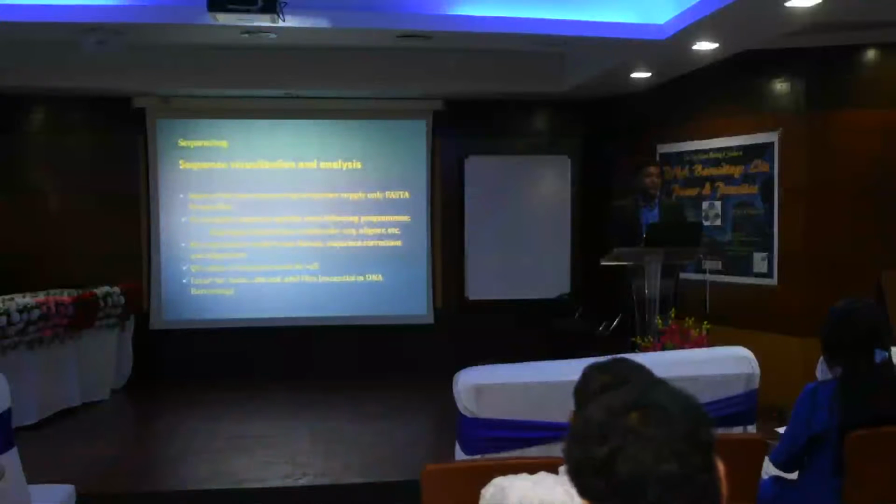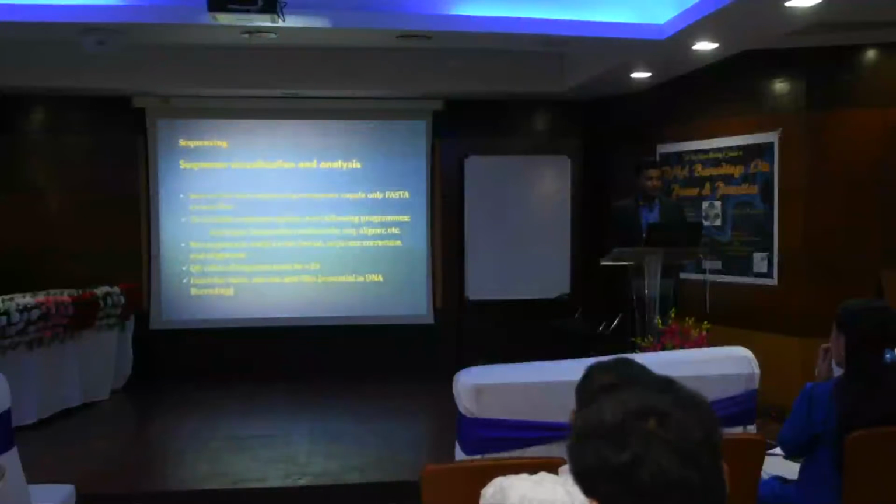Sir, yes, I have one question. During the washing of the DNA, you have mentioned the alcohol wash. Can you mention the temperature, like whether the centrifugation can be cooled?